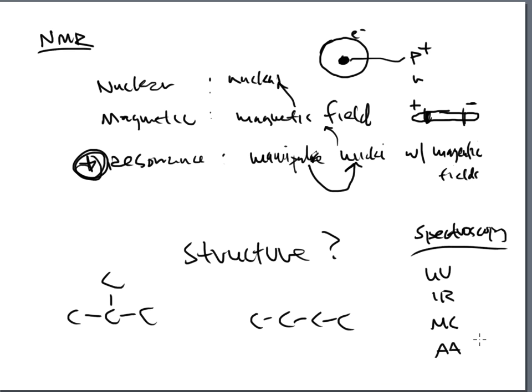The infrared uses something like light energy or a bulb to do a specific job, and you know what that job is. We've talked about it in this course. It's functional group identification. And then the mass spectrometer doesn't really necessarily use a bulb, but it uses somewhat like electron energy in order to do the fragmentation patterns of molecules as they come off from the machine.